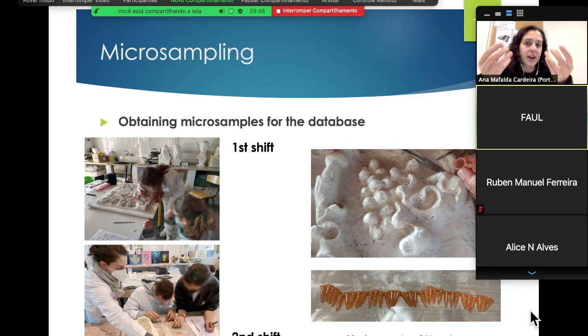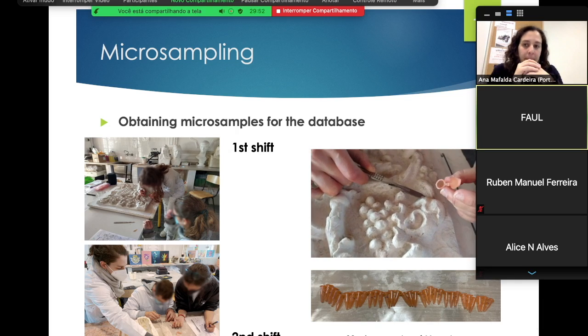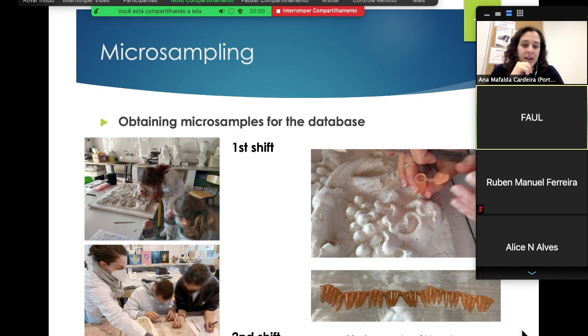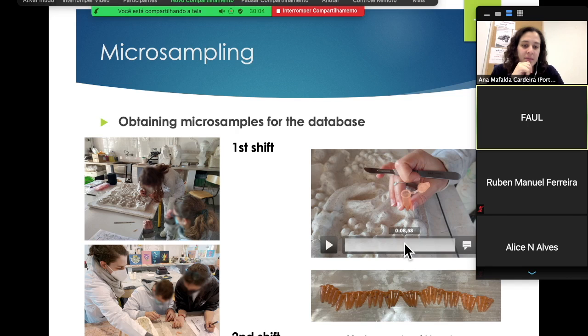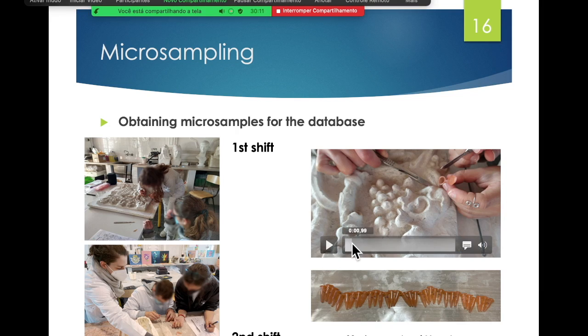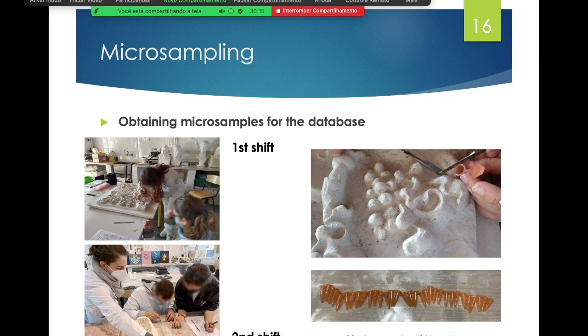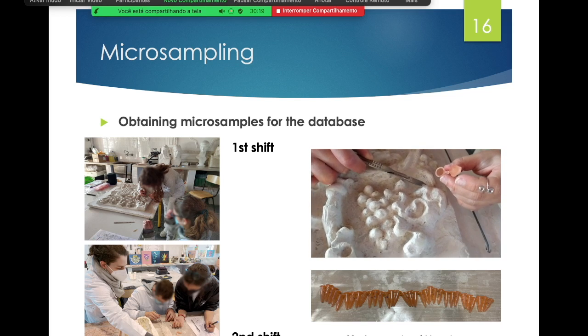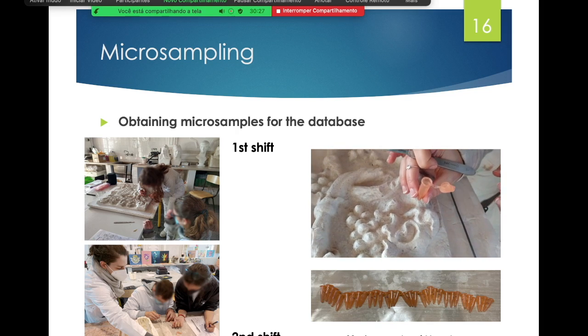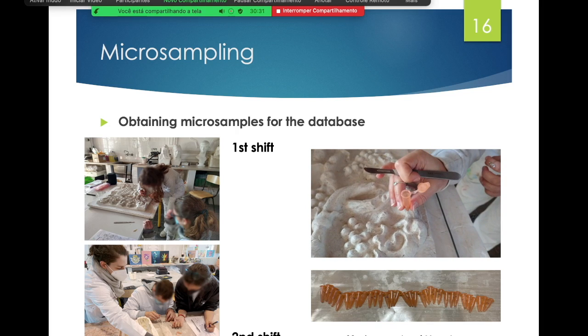These are two people, these are two different hands. It was interesting because, yes, I stopped the video. It was only to say that only students that have been working for three years together can sample with different hands, because when we sample, we do it only ourselves with both hands, and they did it with different hands. One used the right hand, and the other person used the left hand. And only people that work very closely can do this kind of sampling. That was only the objective of this video.